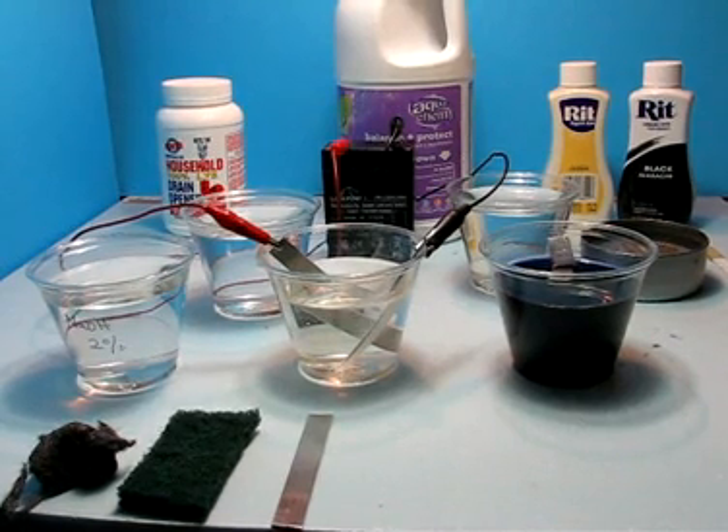Hi, this is Ken. Welcome to my home chemistry laboratory. Today I'd like to share with you some results that I've had in trying to replace the sulfuric acid and battery acid with sodium bisulfate, which is a safer and equally functional material.